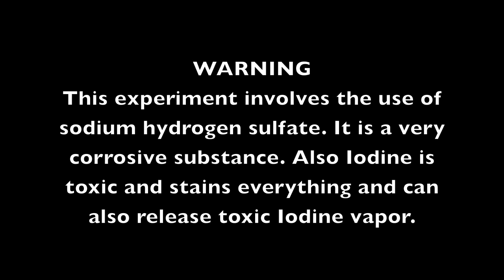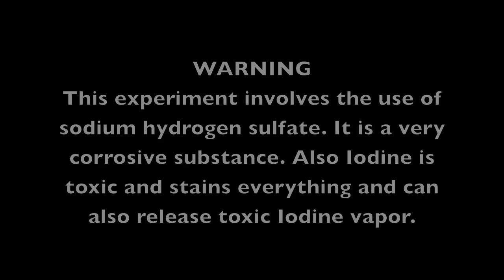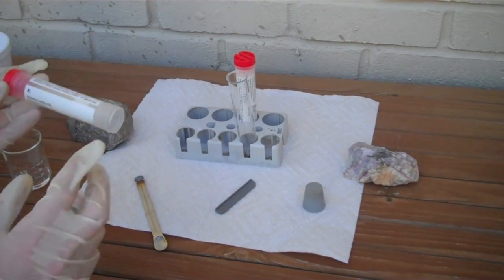Warning: this experiment involves the use of sodium hydrogen sulfate. It is a very corrosive substance. Also, iodine is toxic and stains everything, and can also release toxic iodine vapor. Remember to be safe. Today I'll show you how to make iodine.